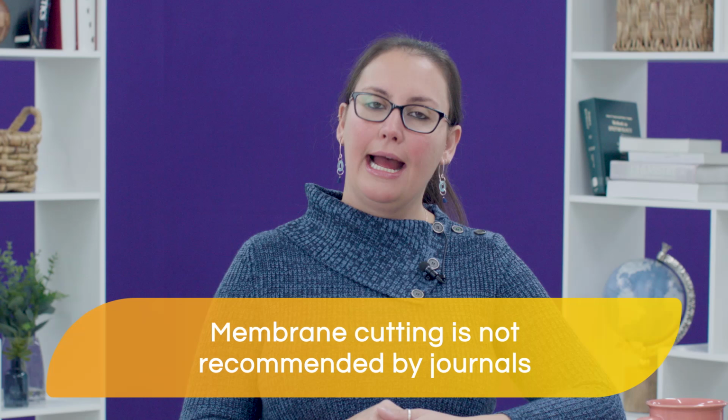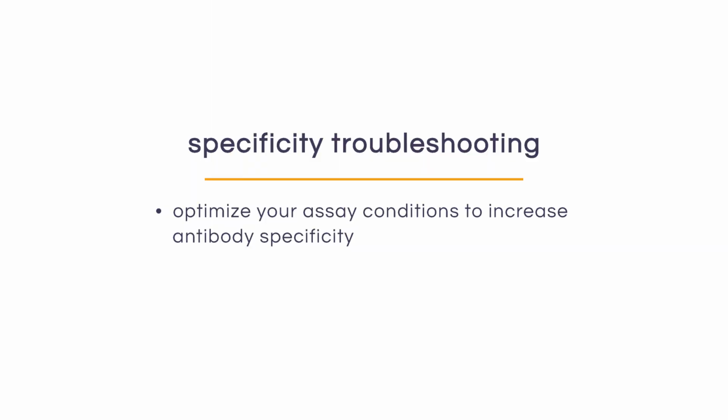The principle behind that is that your primary antibody should be specific enough so that you don't have to cut the membrane. If that is not the case, you should go back and optimize your assay conditions to increase antibody specificity, or if you're not able to do that, just change your primary antibody altogether.